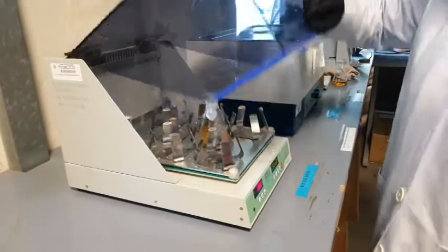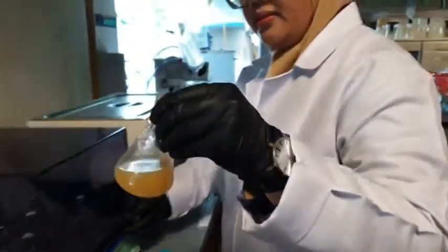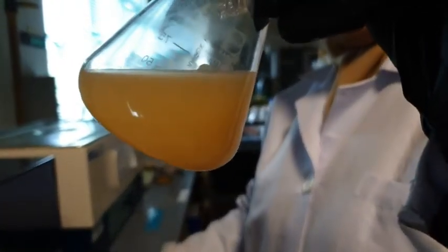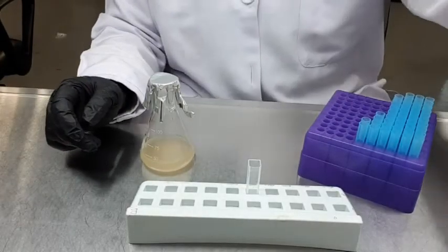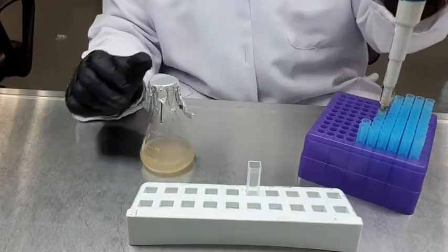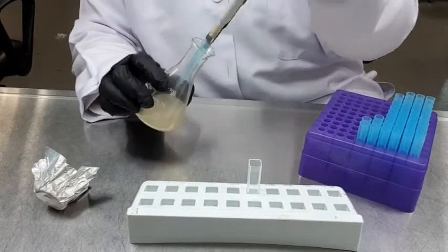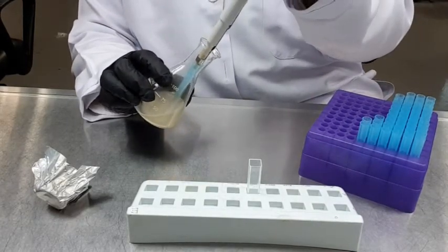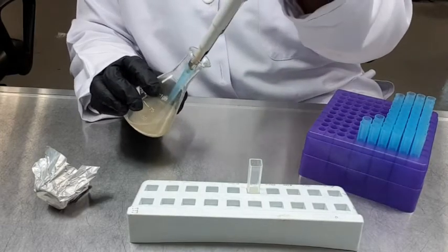After 12 hours, take out the yeast culture from the incubator. The yeast culture turns cloudy, which indicates that the yeast is growing. By using a micro pipetter, pipette out 3 ml of yeast culture and place it inside a clean cuvette.